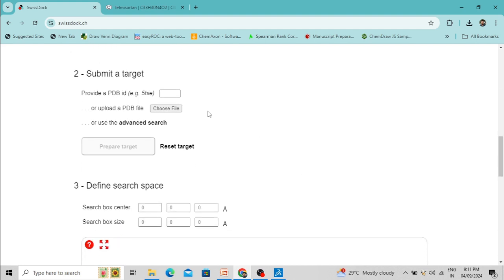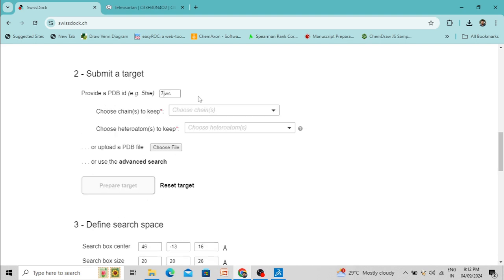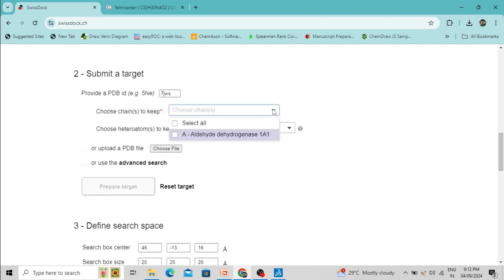Now it's time to upload the protein molecule. You can directly type the PDB ID of your protein — this server can detect the PDB ID from the database. I am typing here '7JWS', which is the PDB ID for the enzyme Aldehyde Dehydrogenase. You can see 'Aldehyde Dehydrogenase 1A1' appears here and I have selected it.